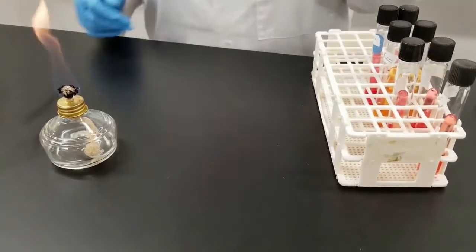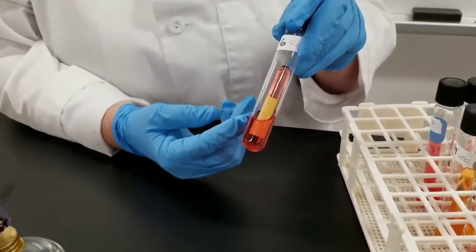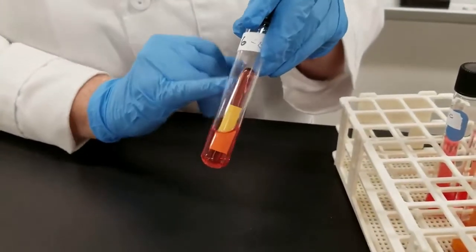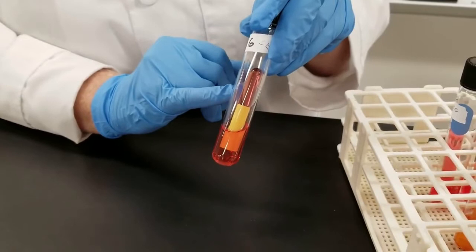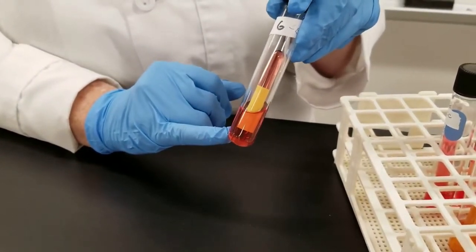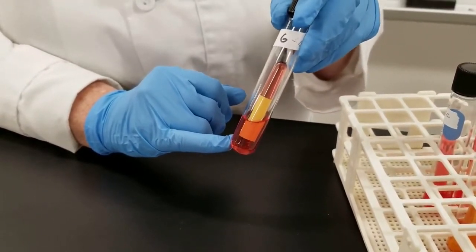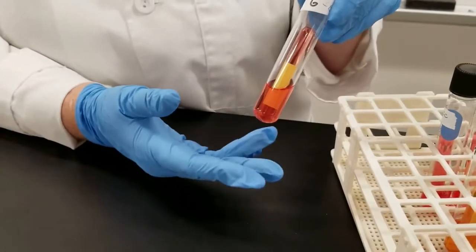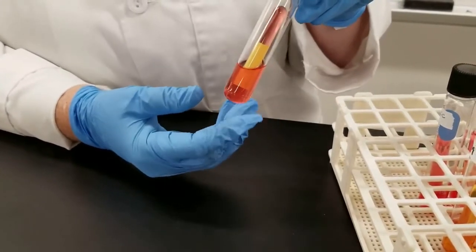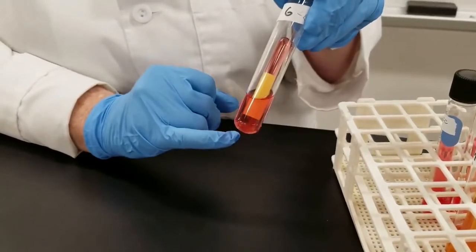In these tubes we have in a broth solution the sugar and then we have these inverted tubes, often also known as a Durham tube. What we're going to do is inoculate this medium with the bacterial culture. Some will not be able to use the particular sugar in question. Most things will be able to use glucose but some of the others, some organisms can use them, some cannot.